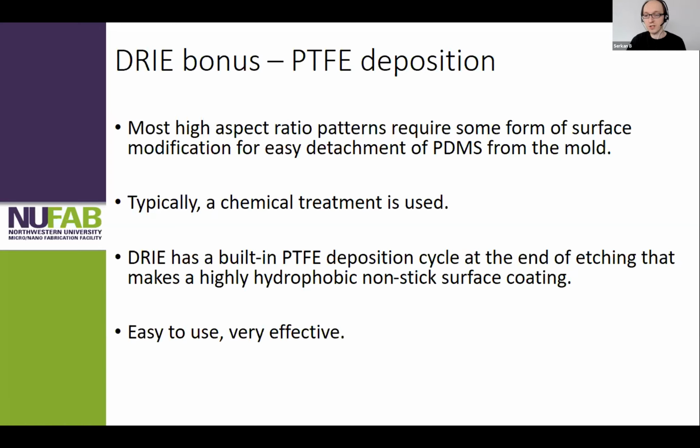Your surface will be extremely non-stick and hydrophobic. We got very good feedback from users when they use this material on their molds, and they can easily peel off their high aspect ratio patterns from the surface. So it's very effective, and it's not specific to DRIE too. Even if you make your mold with SU8 or the laser ablation, which will be coming in a minute, you can still put it in the DRIE chamber and just coat it with this PTFE material. That way you'll get a nice mold.